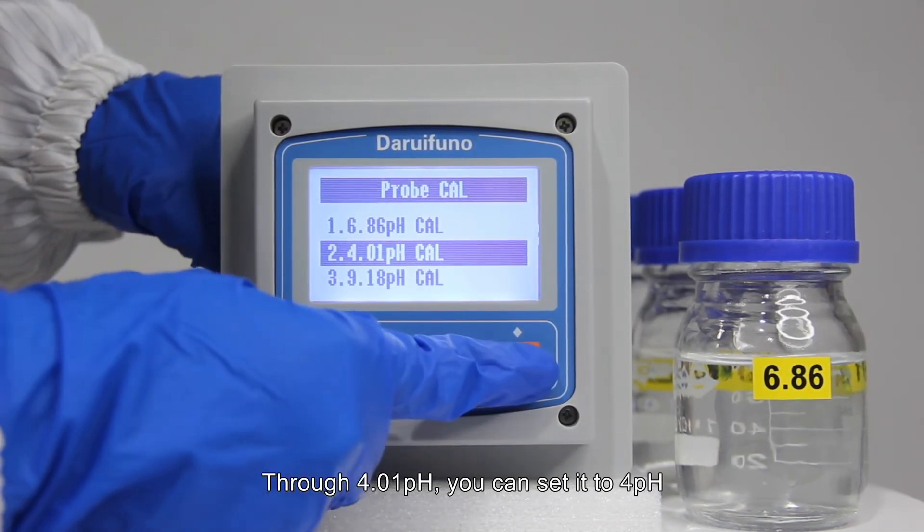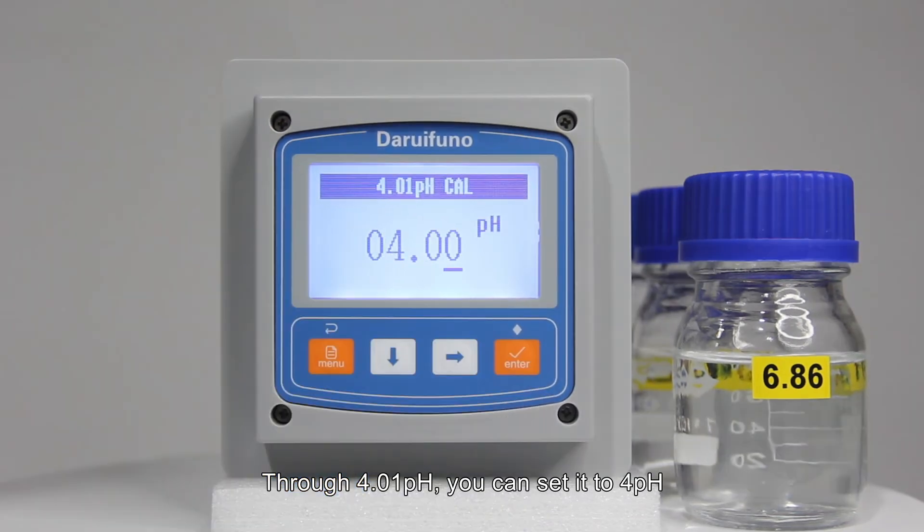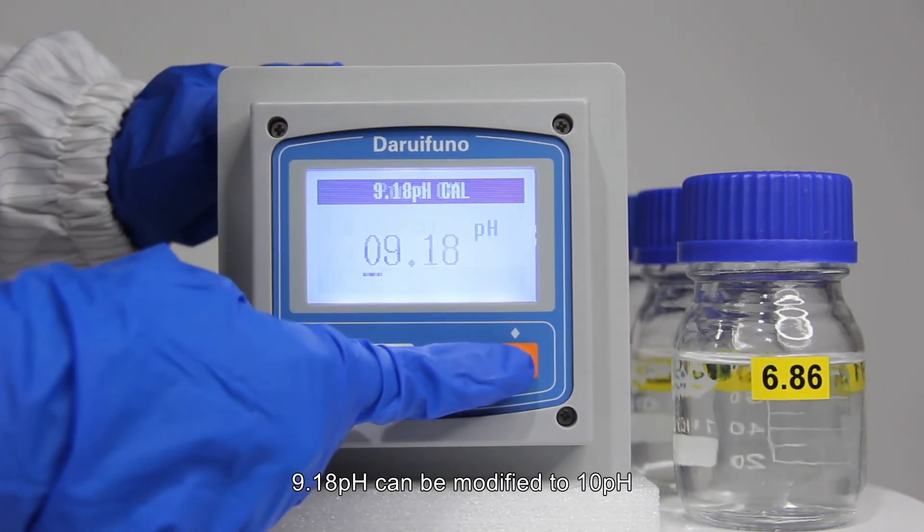Similarly, through 4.01 pH you can set it to 4 pH, and 9.18 pH can be modified to 10 pH.